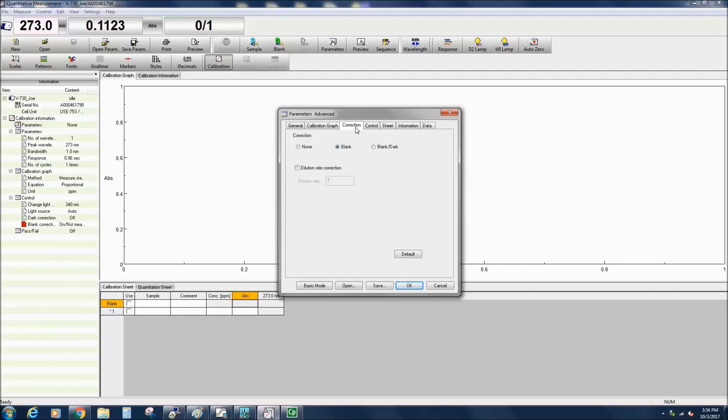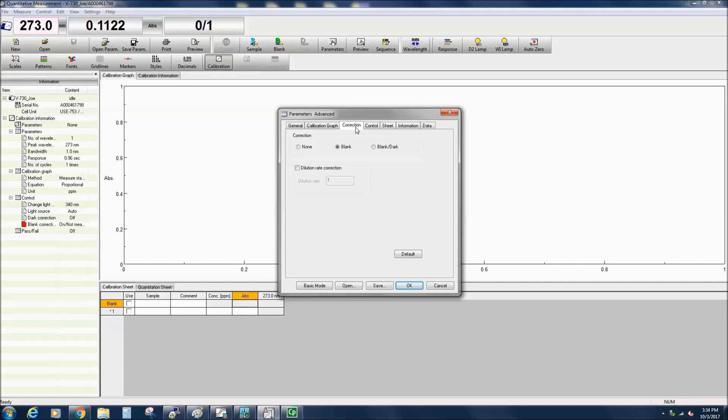In Advanced mode, the Correction tab lets you select whether to correct your absorbance data with a baseline, blank, or a dark correction. The dark correction measures the absorbance with the beam path blocked by a shielding plate. It is recommended for samples with high absorbances and cannot be selected when in Basic mode.